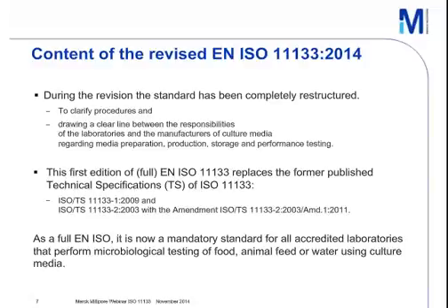This first edition of the full EN ISO 11133 replaces the former published technical specifications of the same standards, which were in two parts published, part 1 from 2009 and part 2 from 2003 with an amendment from 2011. As a full EN ISO, European standard and international standard, it is now a mandatory standard for all accredited laboratories that perform microbiological testing of food, animal feed or water using culture media.